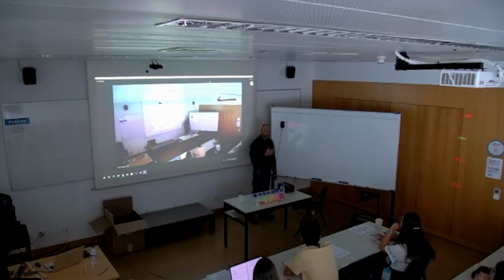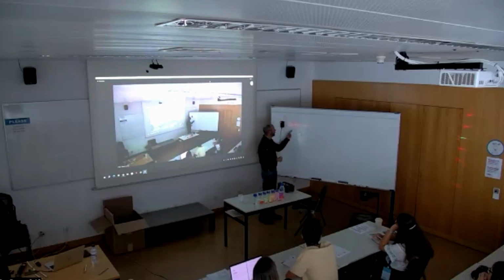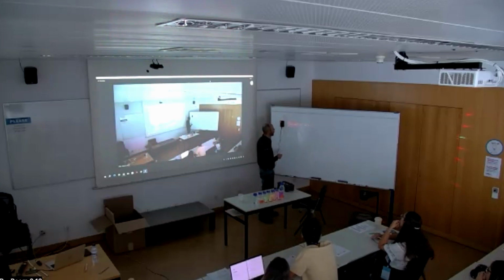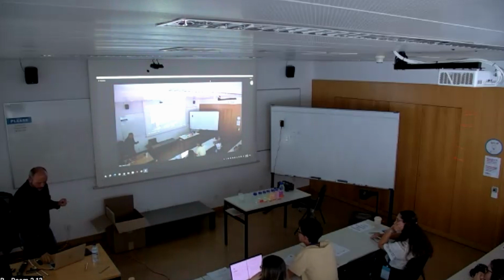And there are corrections for this, and I can show you that if we put a lens that diverges the light in an appropriate manner, opposite to the converging lens, then we can focus all the rays in the correct position. And that's why objective lenses that are corrected are made of multiple lenses, because each lens compensates for some aberration. All right, so this one is a very simple demonstration. These are very simple lenses. But it gives you the first point, and this also brings me to the fact that we need to share again.